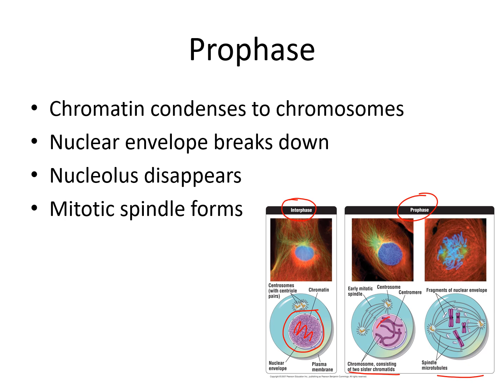The chromosomes are condensing until they are fully condensed during late prophase. You also see the nuclear envelope breaking down until it's all gone at the end of late prophase. The nucleolus is going to disappear and the spindle fibers are forming. These are the spindle fibers here, and they are forming and attaching to the chromosomes.